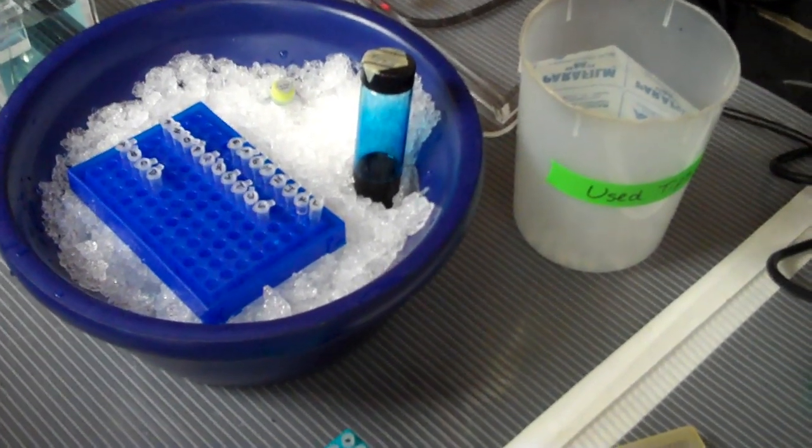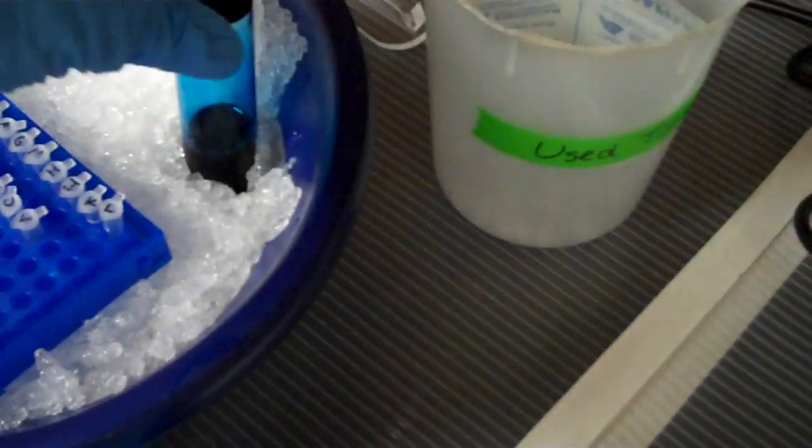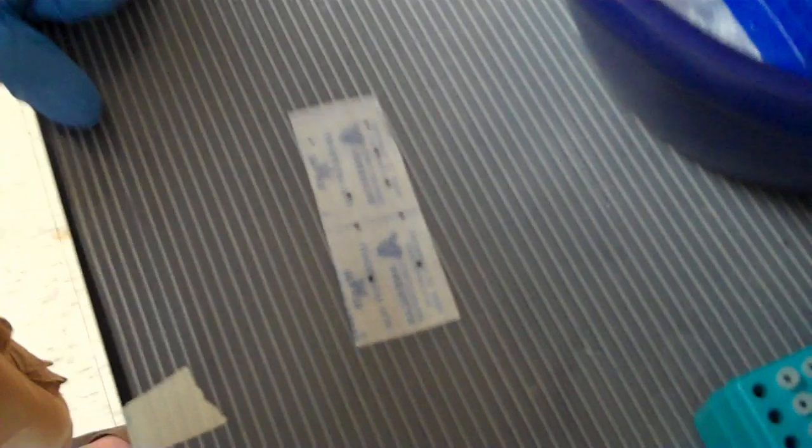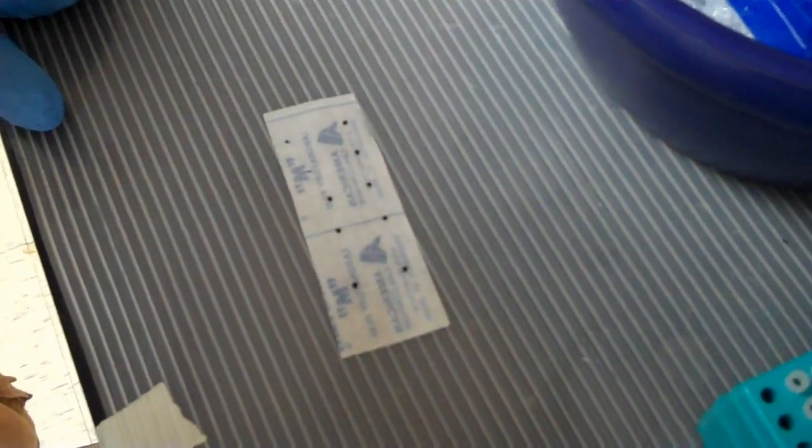This is how you load a gel. First, take two microliters of loading dye and put it on a slice of parafilm for each sample you'll have.